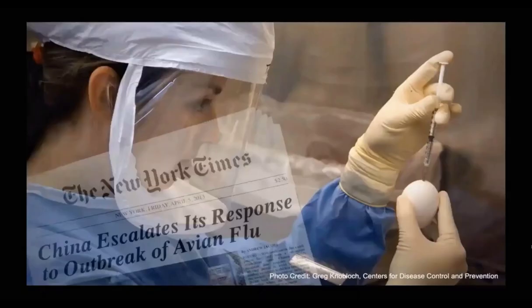We immediately realized the BioXP's potential to address global pandemics and started working with a vaccine manufacturer and the US government to bring this to fruition. It was shortly after we built the BioXP that we received an email from an international health organization alerting us that 2 men died in China shortly after contracting the H7N9 bird flu. There were fears of a global pandemic as the virus started rapidly moving across China.